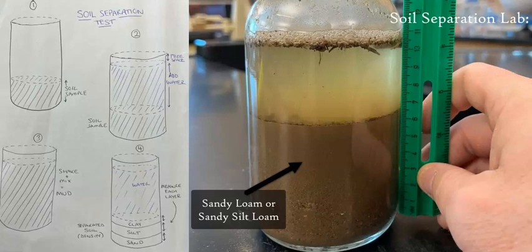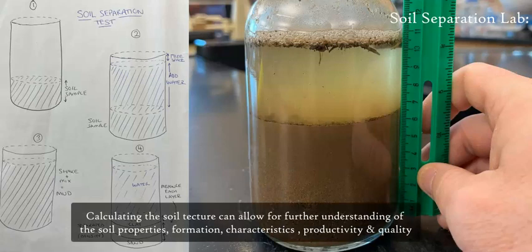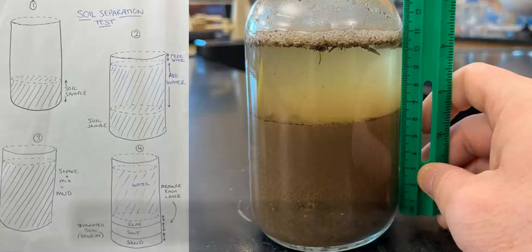Once you've established the soil texture, you can then use this texture to understand the soil a bit better in terms of the soil fertility, the soil percolation rates, and all these different attributes that the texture would give the soil, and you'd have a better understanding of the landscape, perhaps the erosion rates, what kind of plants or animals would inhabit this area based on the soil and the kind of biomes you have, so you can apply it to anything you want once you've established the soil texture.